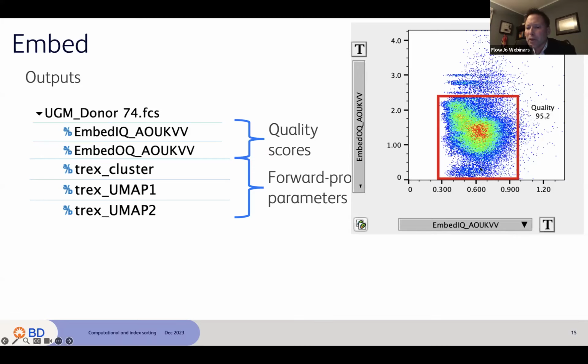The ones down here in the bottom left are the ones that are best. So here's the picture of the one that has a pretty wide range of quality scores. As you get farther away here, that implies that there wasn't a good nearest neighbor, and the output means the cells are fairly distant from any of the islands in the tSNE plot, etc. So if you want the cells that modeled absolutely perfectly, you would pick something towards the lower left. If you're interested in seeing what cells are novel for the follow-up experiment, those are the ones up here, the ones that did not have equivalent cells in the initial experiment.